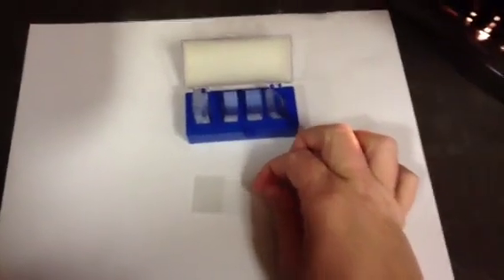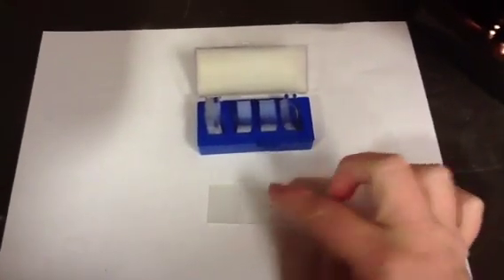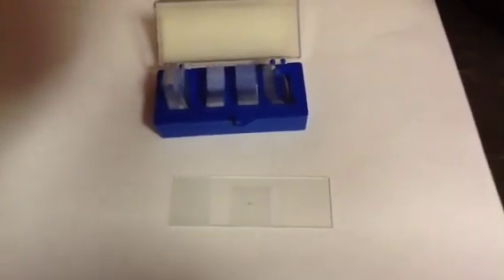I'm going to place a small sample of a piece of sponge on my slide. It's so small, you can barely even tell that anything's there. Next, I'm going to put a cover slip over the top of it. This protects the lenses on the microscope and also helps your sample stay put. Then I'll take my sample and look at it under the microscope.